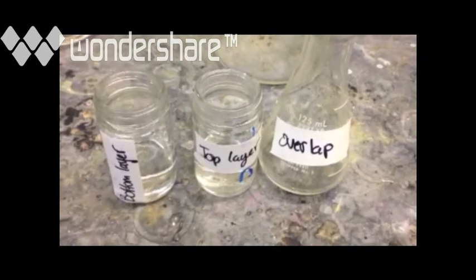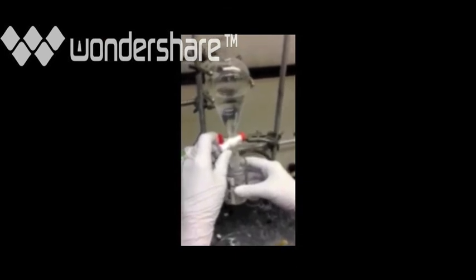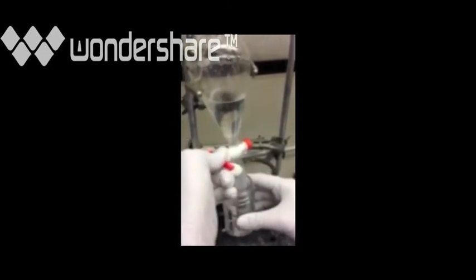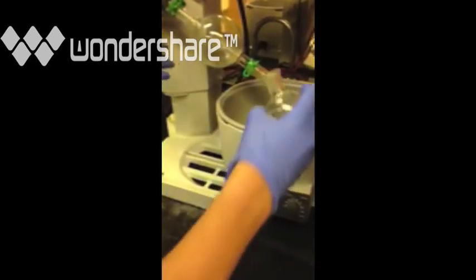Now take 3 jars and label them, and then you can begin to separate. Twist it until the liquid starts pouring out. Make sure that you stop just before the bottom layer is completely drained. Then once you have the bottom layer, the organic layer, which is in dichloromethane, you can take it and rotovap it and isolate it and do analysis on that.